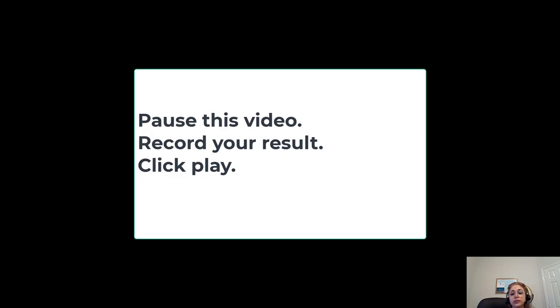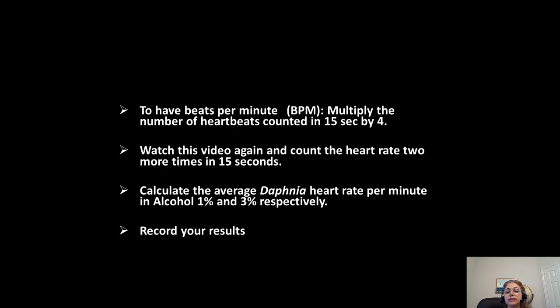Now you need to pause this video, record your result, and then click play. To get beats per minute, multiply the number of heartbeats counted in 15 seconds by 4.